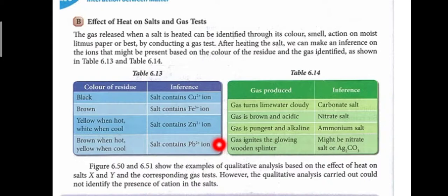If the gas ignites a glowing wooden splinter, it might be a nitrate salt or silver carbonate salt.